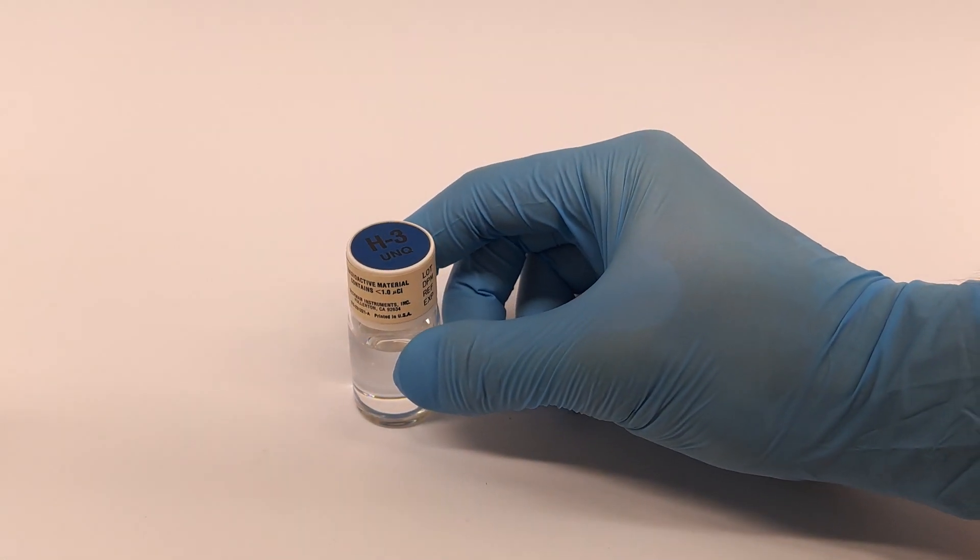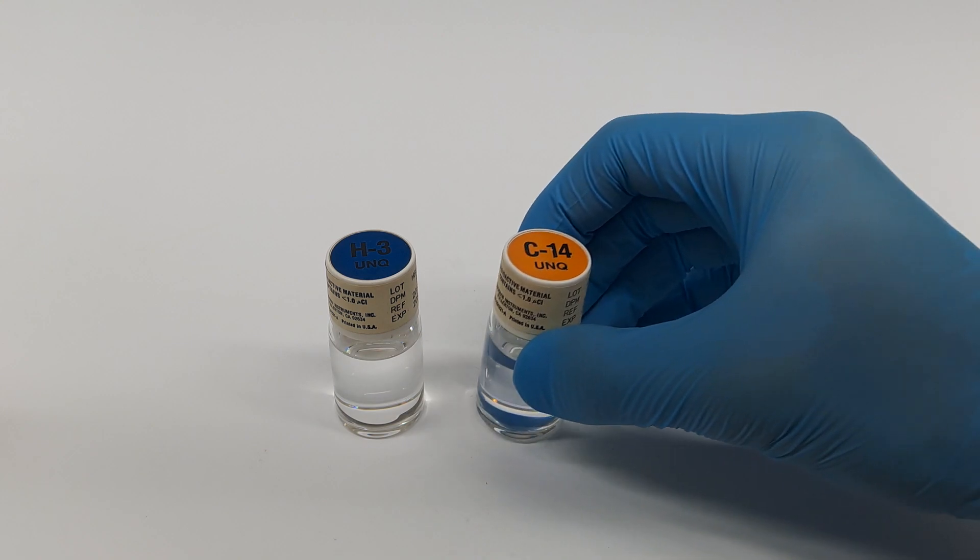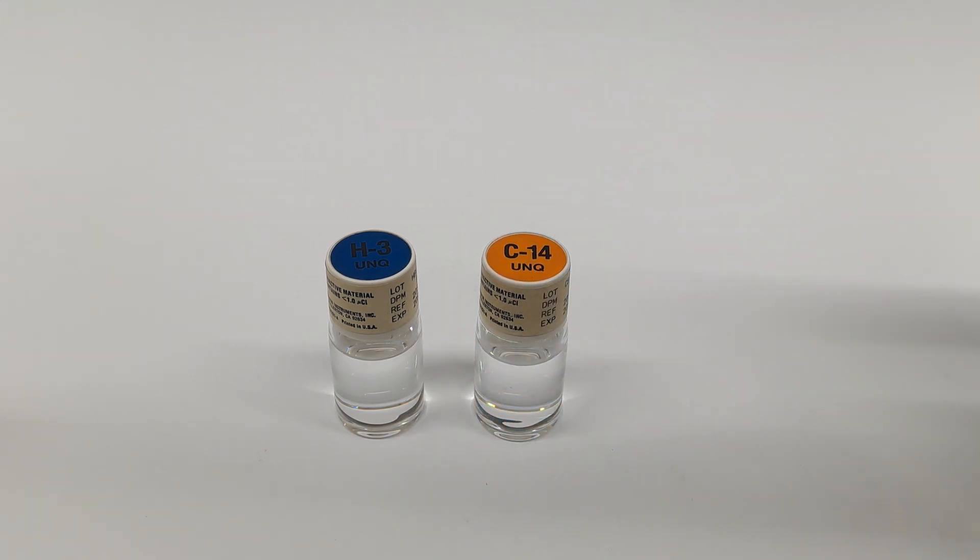Today, I will give you an insight into the function and operation of one of our larger measurement devices, the LSC. LSC stands for Liquid Scintillation Counter. In German, it's Flüssig-Sintillationszähler. We will discuss what scintillation is later.